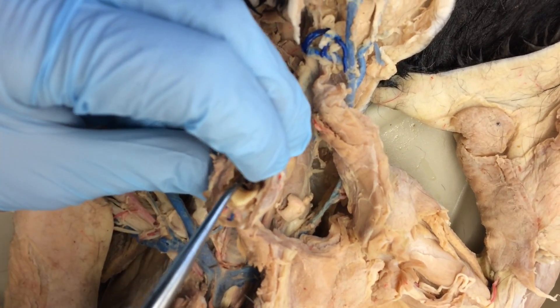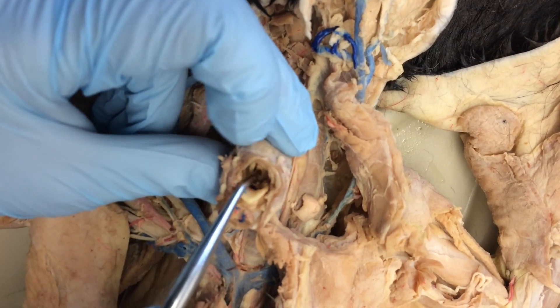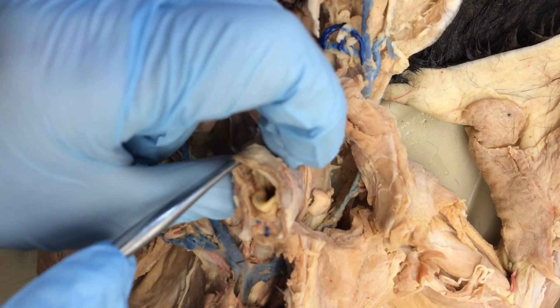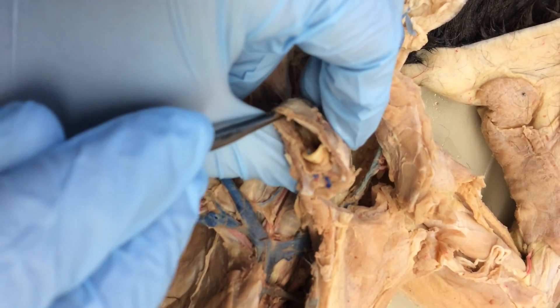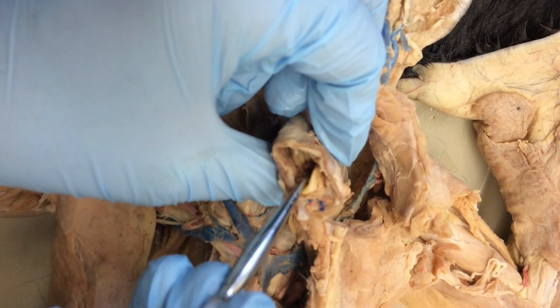Inside, you have these two big hard things that you might want to call the vocal cords. Those are actually the false vocal cords, and they have the cartilage that supports the vocal cords. The true vocal cords are more down in here and they're more muscular tissue rather than that hard cartilage.